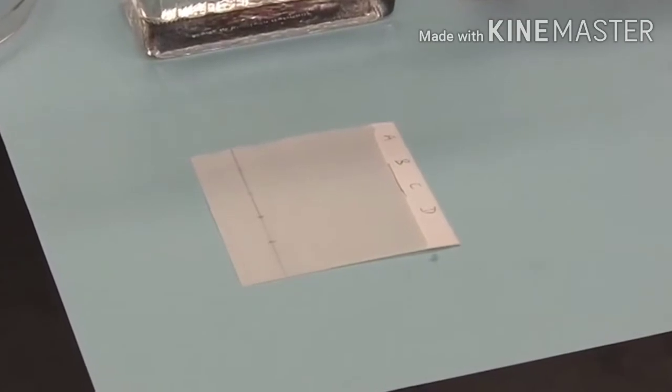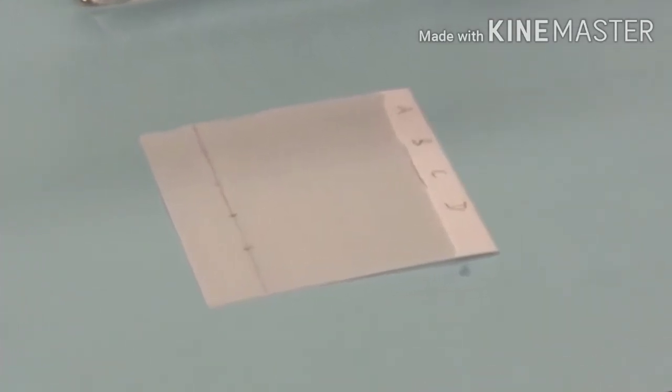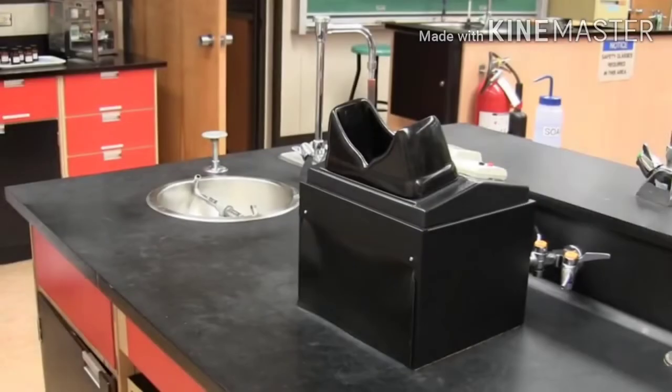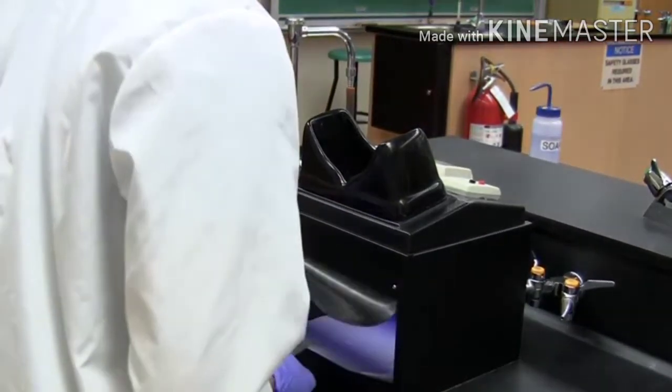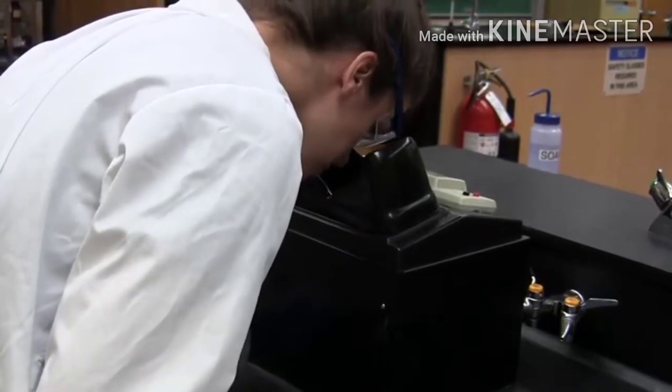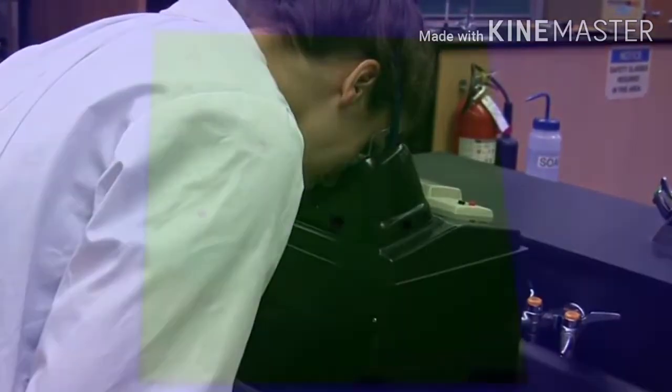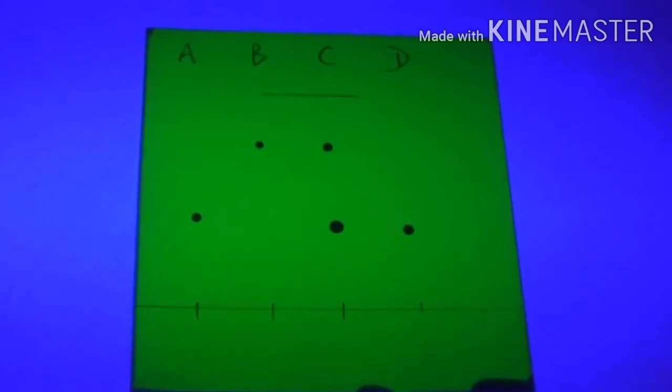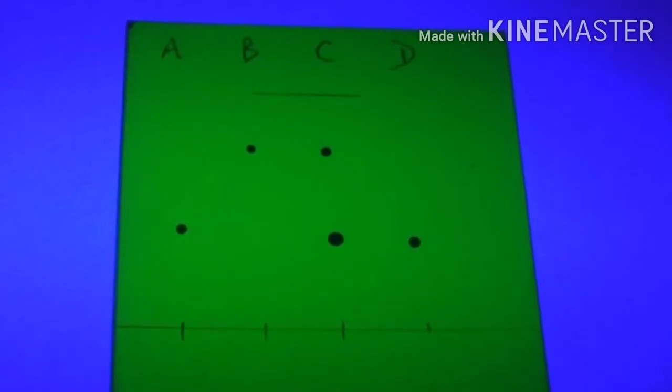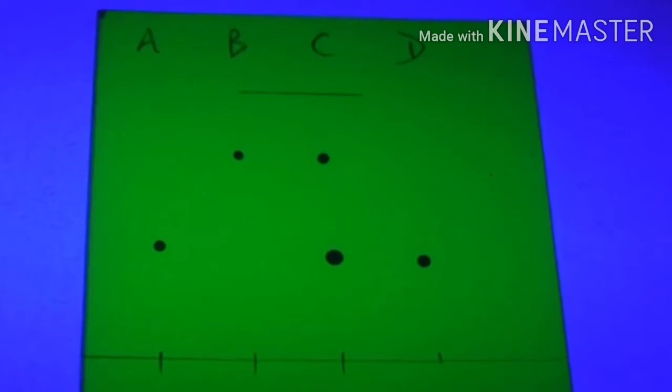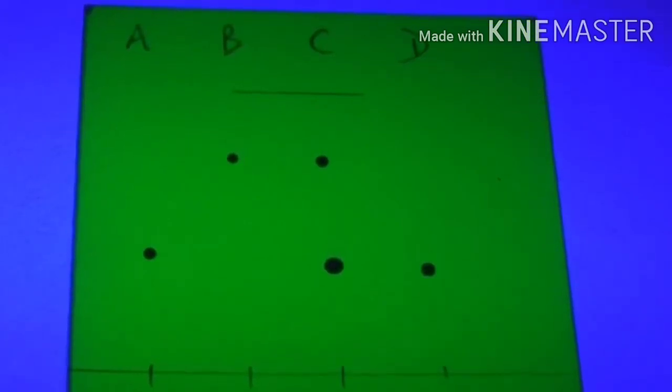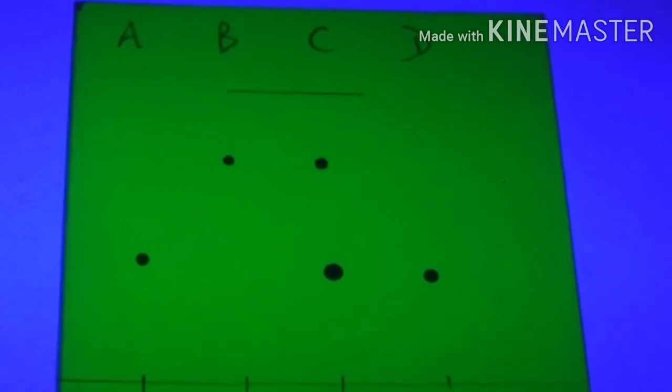There are a number of ways to see, or as we say, visualise, developed TLC plates. A common method is to place the developed plate underneath an ultraviolet or UV light source. This method of visualisation is by far the most common in your lab. If a fluorescent indicator is added to the silica, the silica will fluoresce under UV light. Chemicals on that plate, however, will usually show up as dark spots. Sometimes, when the chemical on the plate is UV active, the spot will fluoresce a different colour than the silica, and be visible in that way. But most compounds will just show up as dark spots against the fluorescent silica background.